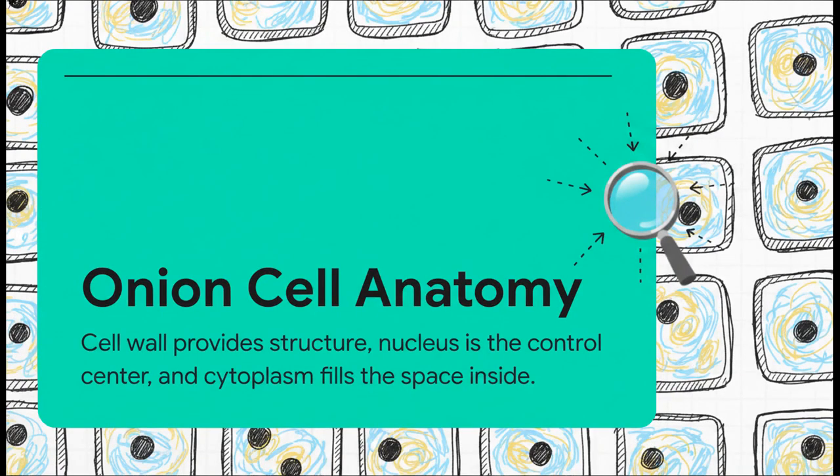Looking at this biological brick wall, we really want to identify 3 distinct parts. First, see those thick, dark borders? Those are the cell walls. They're what provide that rigid structure. Second, that dark little circular spot sitting inside, that's the nucleus, basically the cell's genetic command center. And third, the fluid-filled space taking up the rest of the room is the cytoplasm.